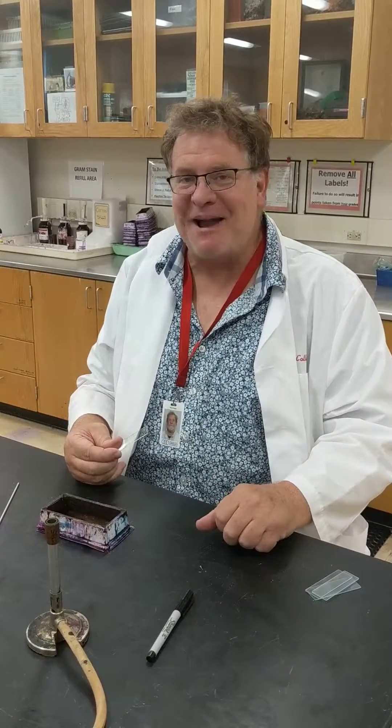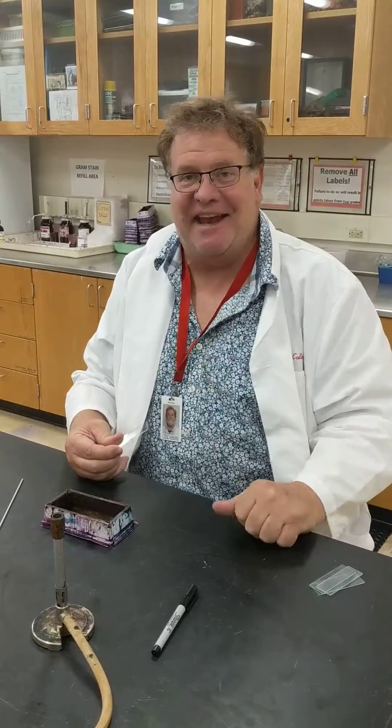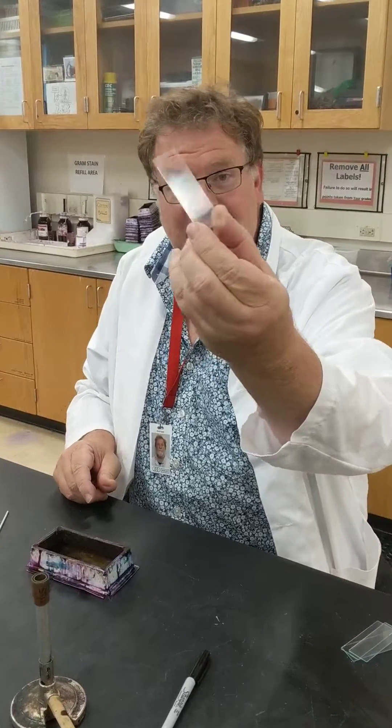Hi, my name is Nick Kapp and this is your Micro Lab Minute. Today we're going to do a simple stain. Basically what you want to do is have your slide that you heat fix.